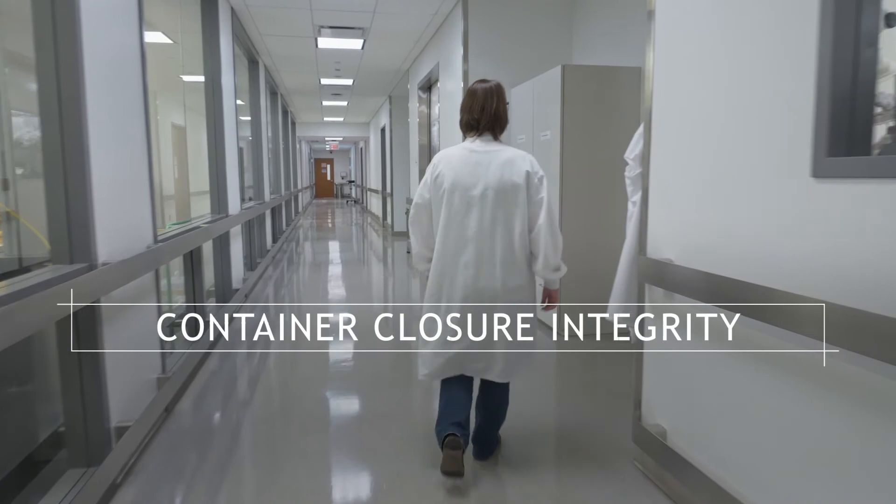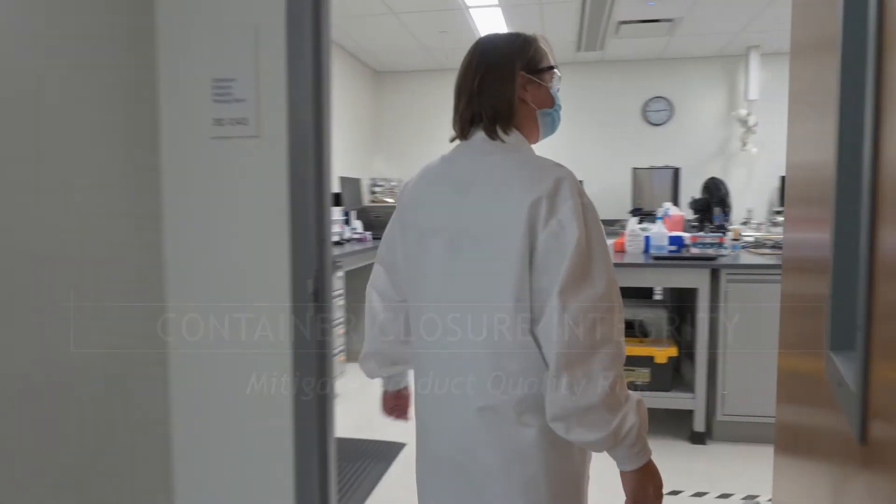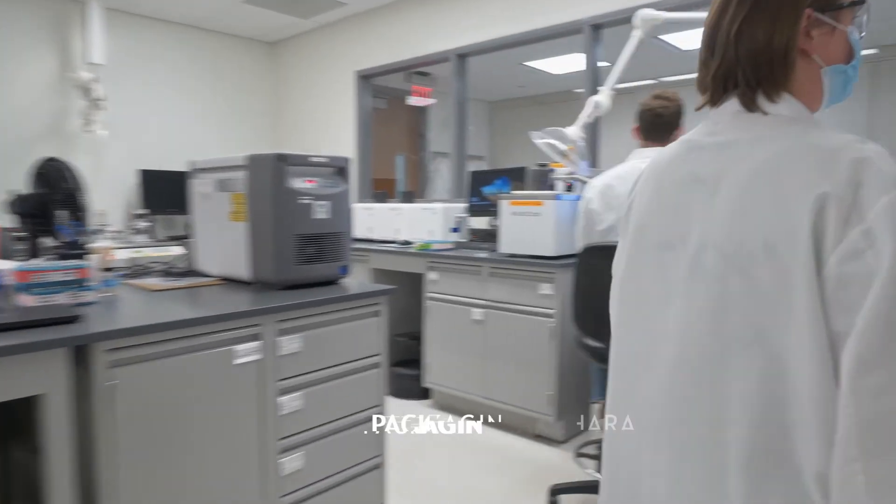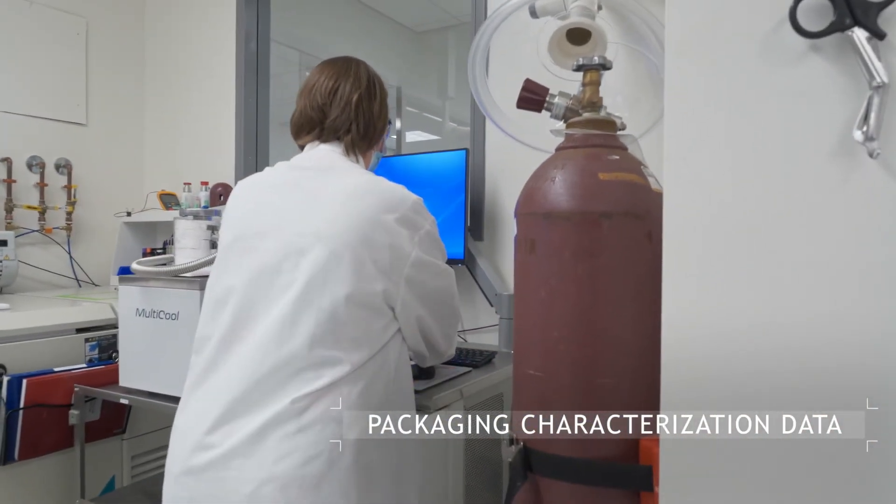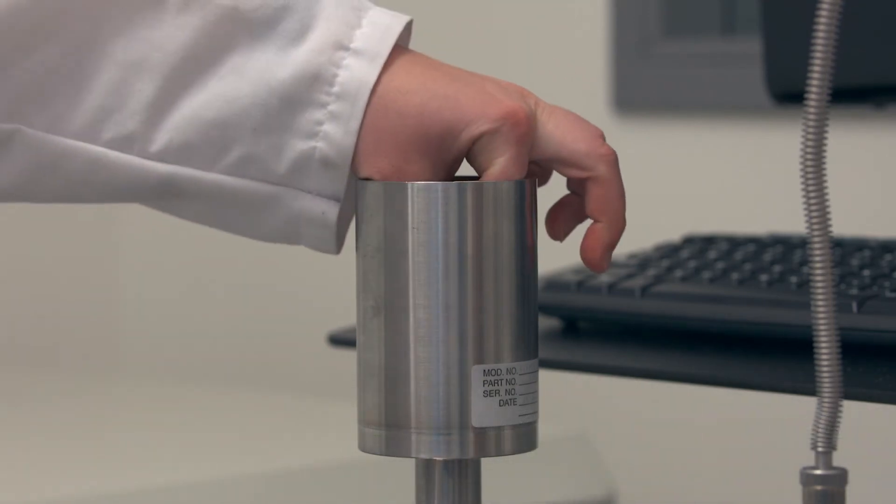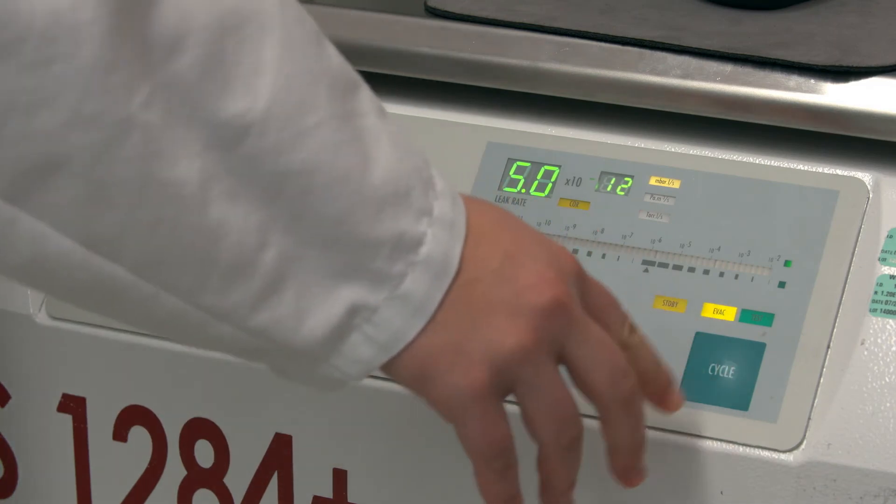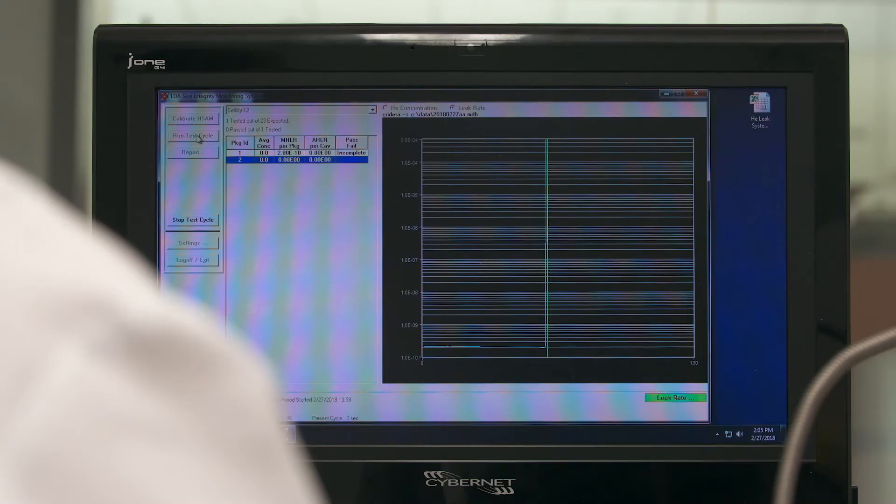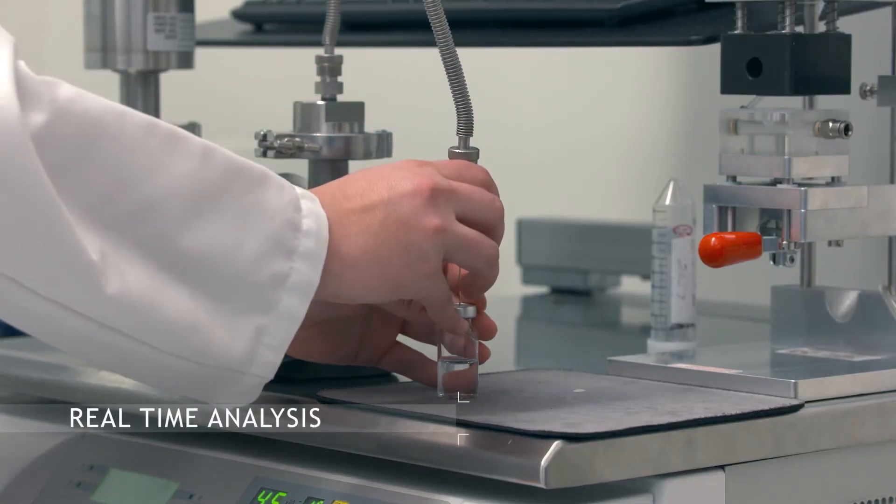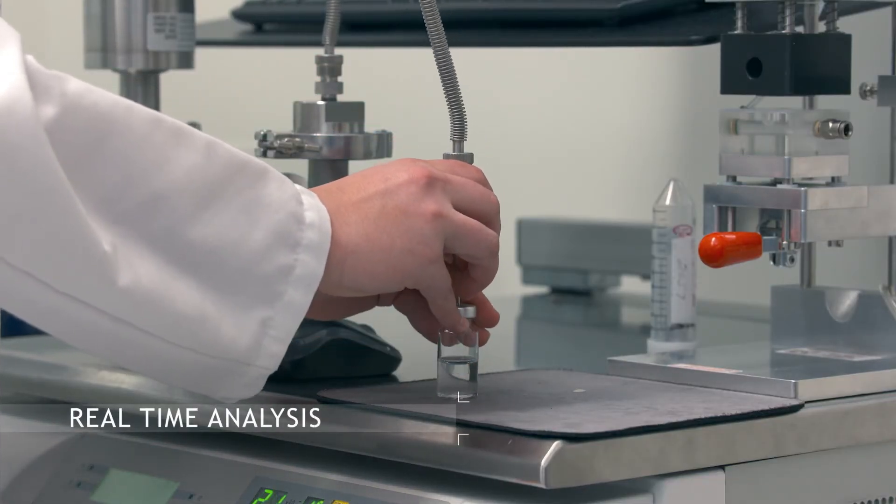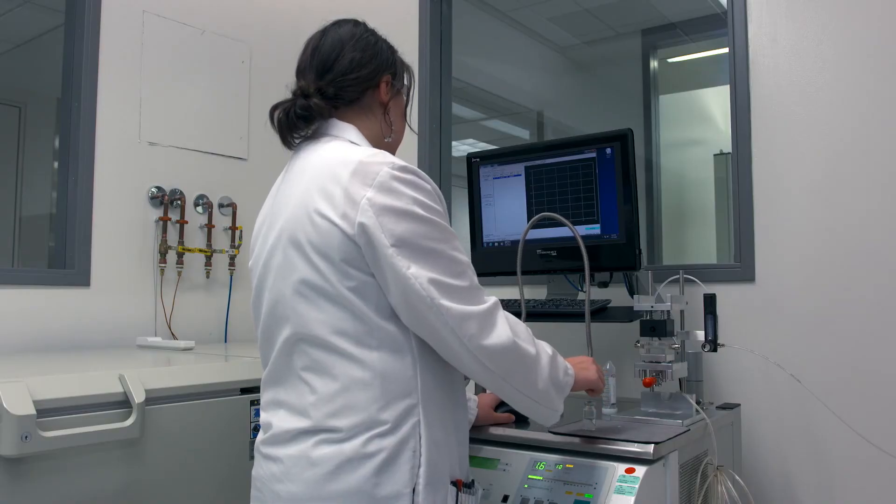With a lab built around USP Chapter 1207 guidance, WEST's container closure integrity experts provide packaging characterization data as well as validated methods and data for a regulatory filing or submission. With a focus on unmatched customer support and the technical expertise to design and execute a variety of studies, partnering with CCI experts at WEST helps ensure not only the integrity of your package, but also the safety of your product and patients.